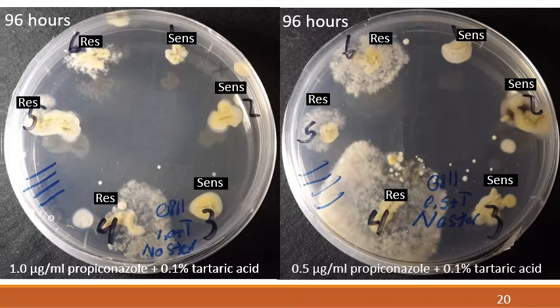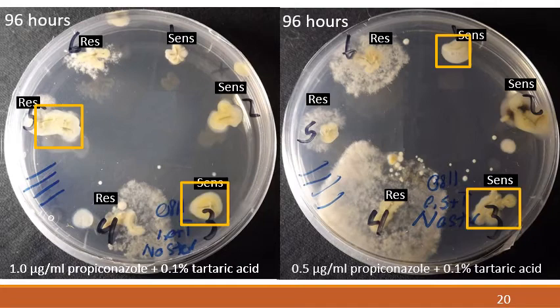This represents the media amended with 0.5 micrograms per milliliter of propiconazole. This suggests that this lower concentration may be better suited for use with field samples, as it makes the results much more apparent. One point of concern is the presence of the yeast colonies growing on these field samples. This may be obscuring or reducing some of the fungal growth of the dollar spot fungus.